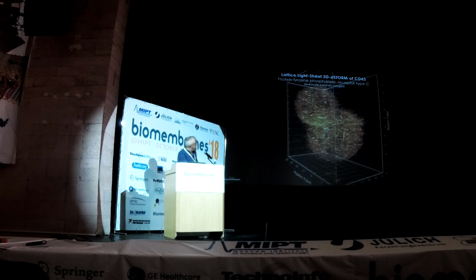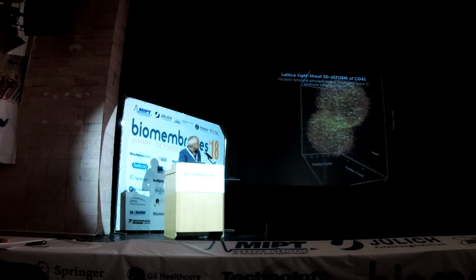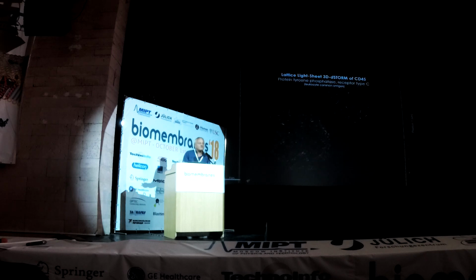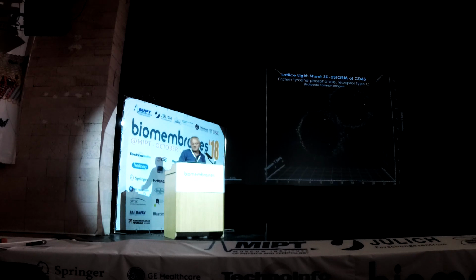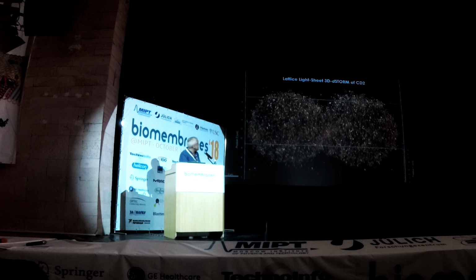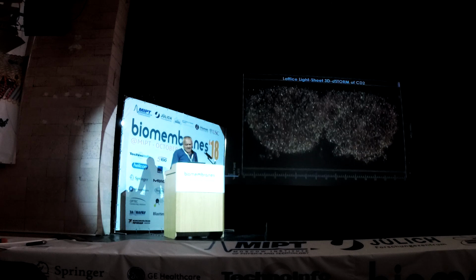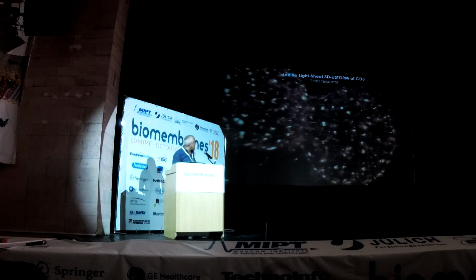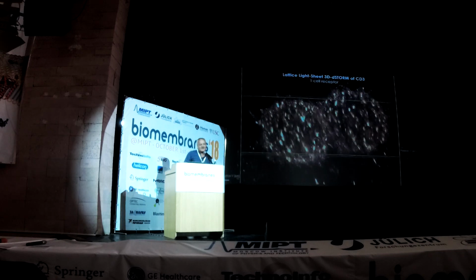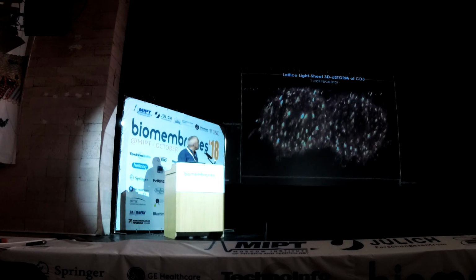And you see some antibodies non-specifically bound. This is the cover slip side, on the cover slip, but the distribution doesn't change. So there is no clustering artifact due to contact with the cover slip, for example. And we have also other examples. This is for CD2, also expressed at high rates, and you can investigate the cell-cell contacts, whether there the distribution of receptor changes, for example. And this is for CD3. Astrophysicists might see something different, but this is for CD3 clustering, and you see that the clusters are not influenced, apical, basal, or cell-cell contact.